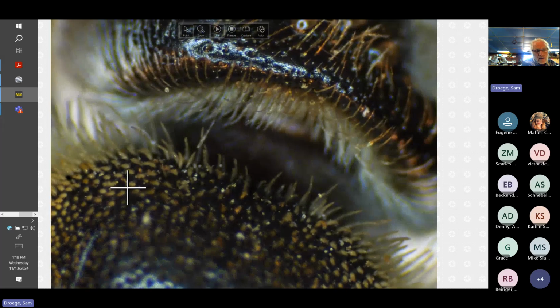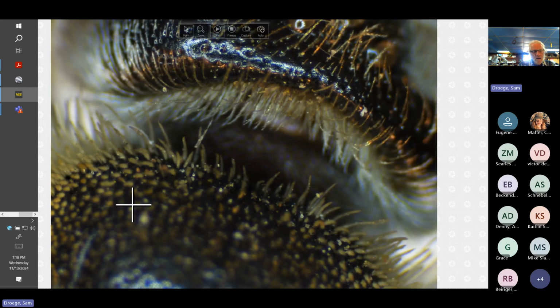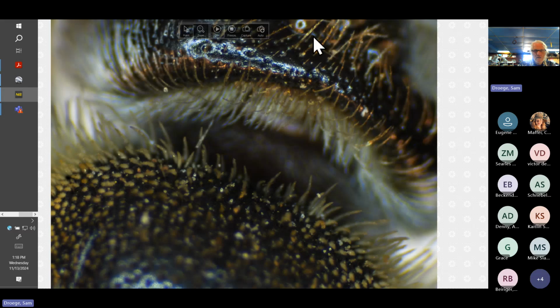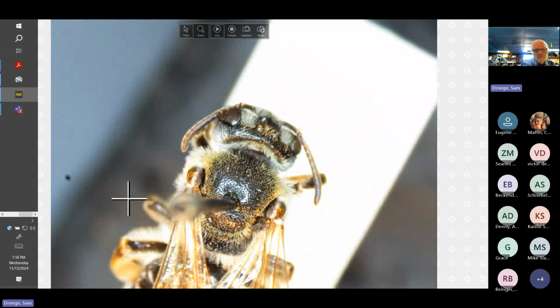And you can see in some of these, looking straight down these hairs over here, these little side hairs, or at least indications that they might be there at the resolution of this microscope. And then it's a strong contrast between these up here, these nice thin normal hairs, which do have tiny little side hairs, but nowhere near this density, making it not so fat a thing.